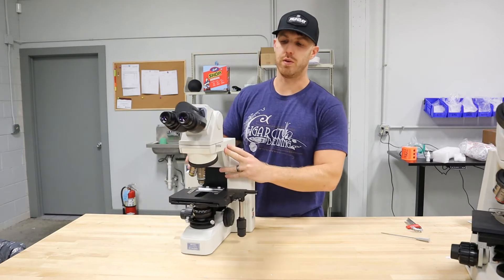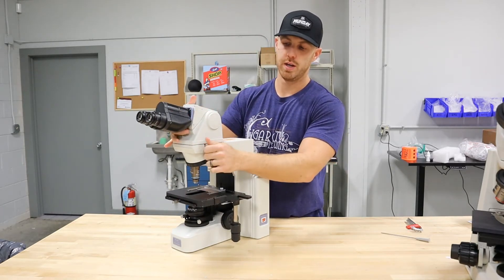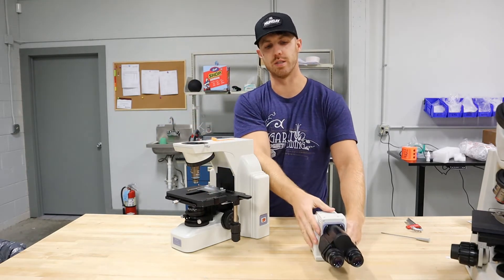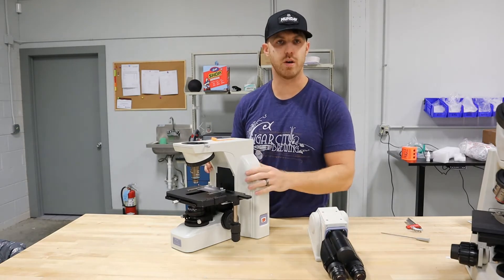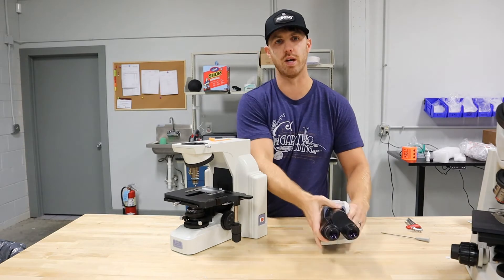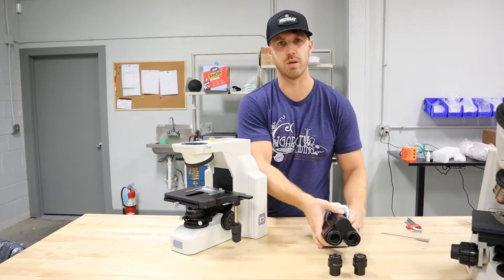First off on the microscope, you're going to have the head. You're going to have a knurled screw here on this side — back that off and the head comes off. Make sure you hold all the pieces with two hands so nothing falls out. You have the eyepieces here; if you flip it upside down, the eyepieces can fall out. You can just slide those out, which is a good idea if you're packing the microscope.